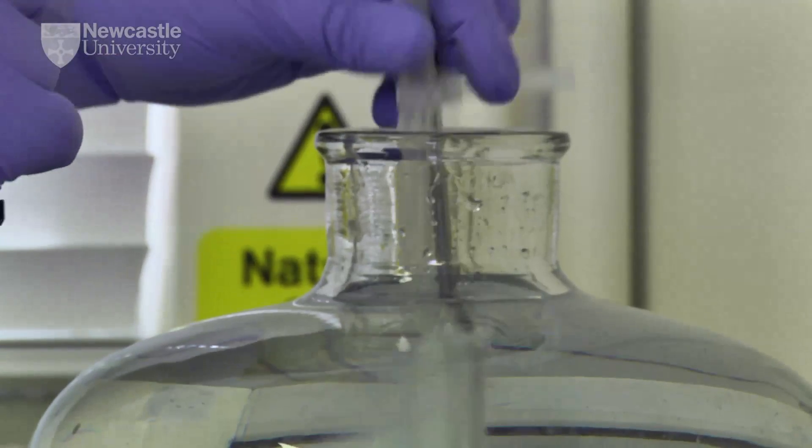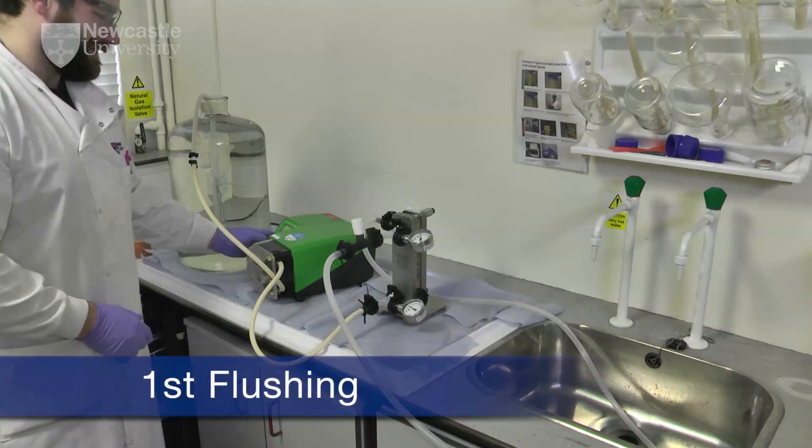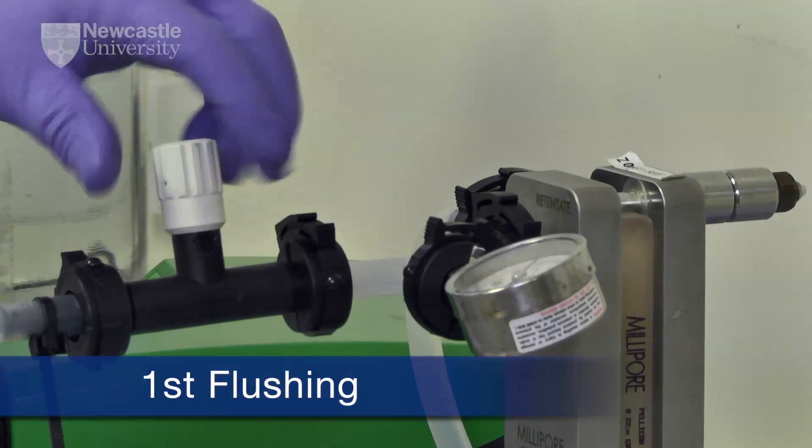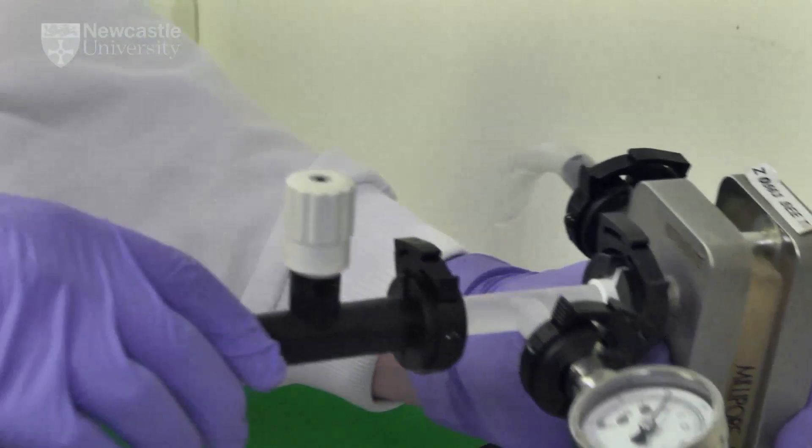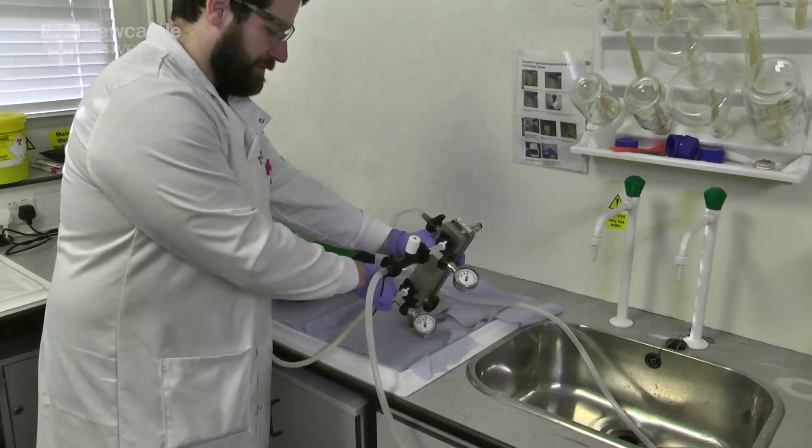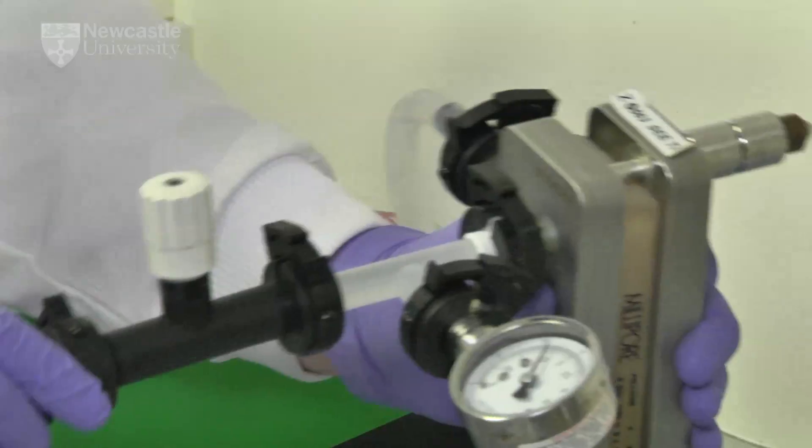Having installed the filtration cassette, the system is flushed with deionised water or similar. Flush water must be pure to avoid fouling the cassettes. Air bubbles can be removed by manipulating the manifold and connected tubing.